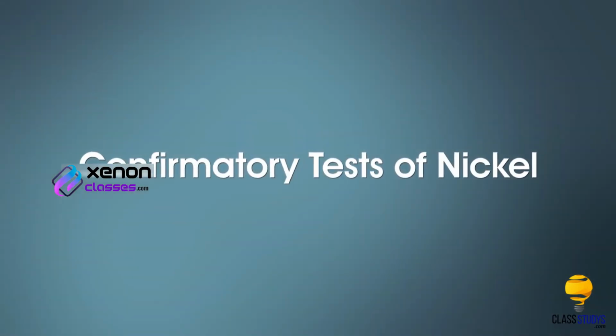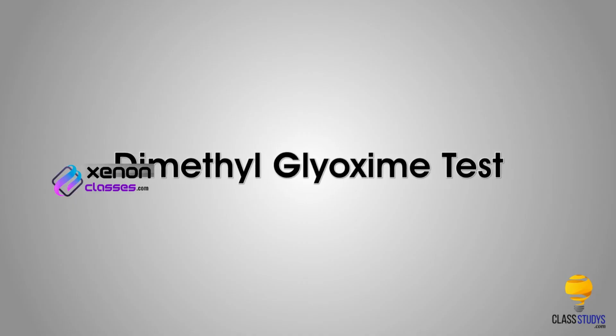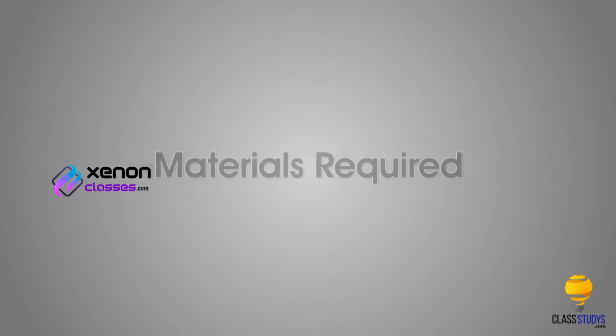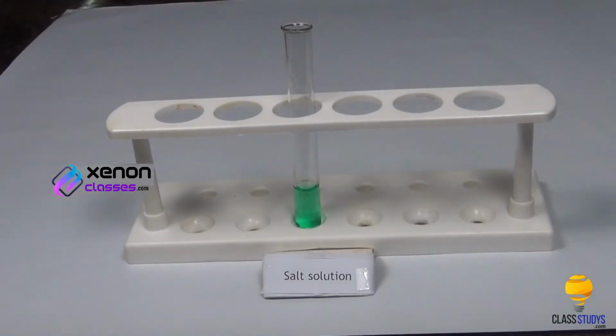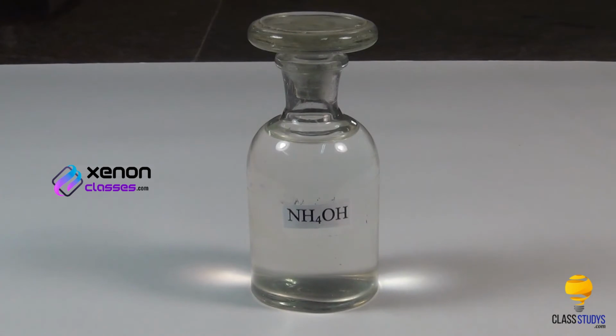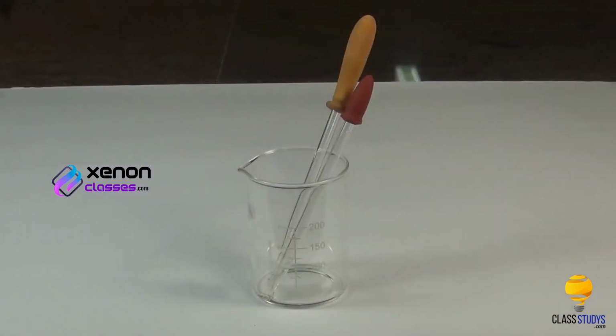Finally, we look at the confirmatory tests of nickel. Dimethyl glyoxime test. Materials required: salt solution in a test tube, ammonium hydroxide, dimethyl glyoxime and droppers.